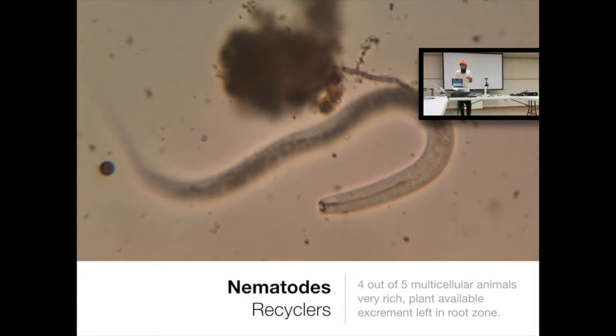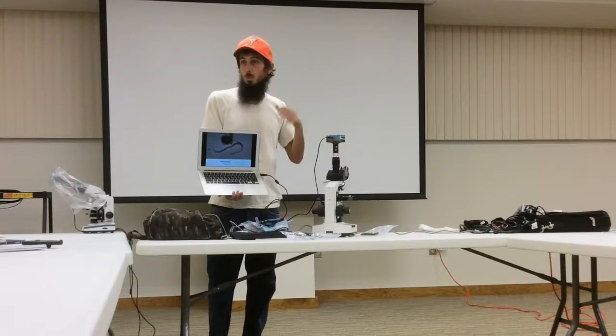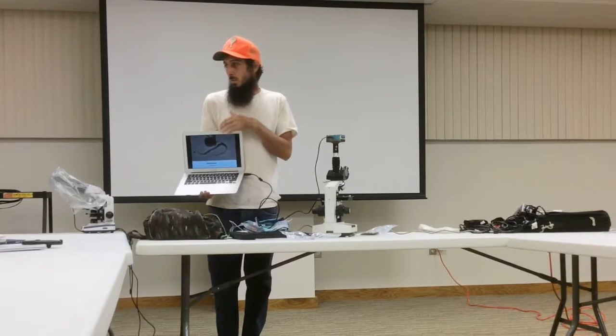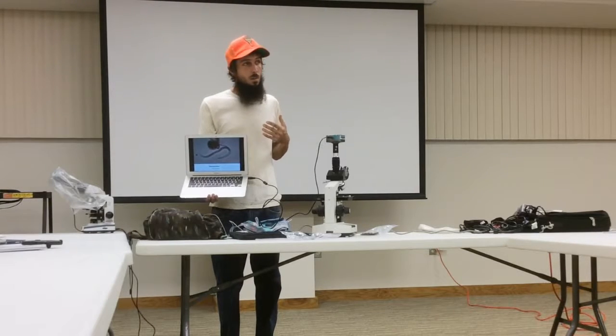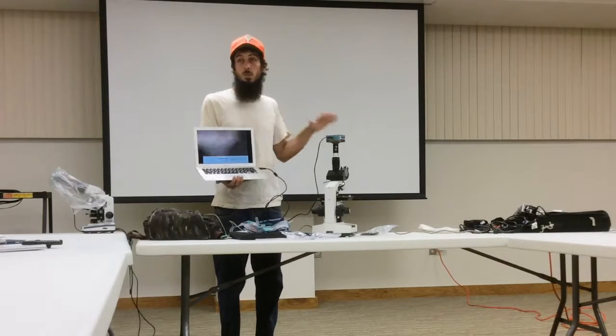And then the other really exciting thing that you'll see, and this is another good measure of soil health, is nematodes. Kunhu Wei, I think that's how you say her name, studies these nematodes specifically, because you can see them at 100 times power. They tell you a lot about the soil, but they're little miniature snakes swimming around. A lot of times people associate nematodes with bad guys, but only root feeders are typically bad for farmers. These guys are everywhere, so having good, healthy nematode populations keeps your root feeders in check.